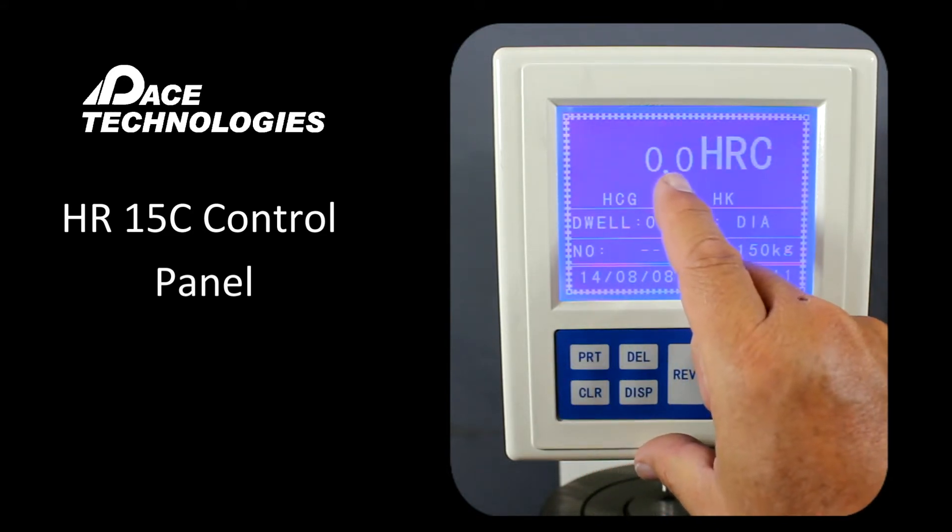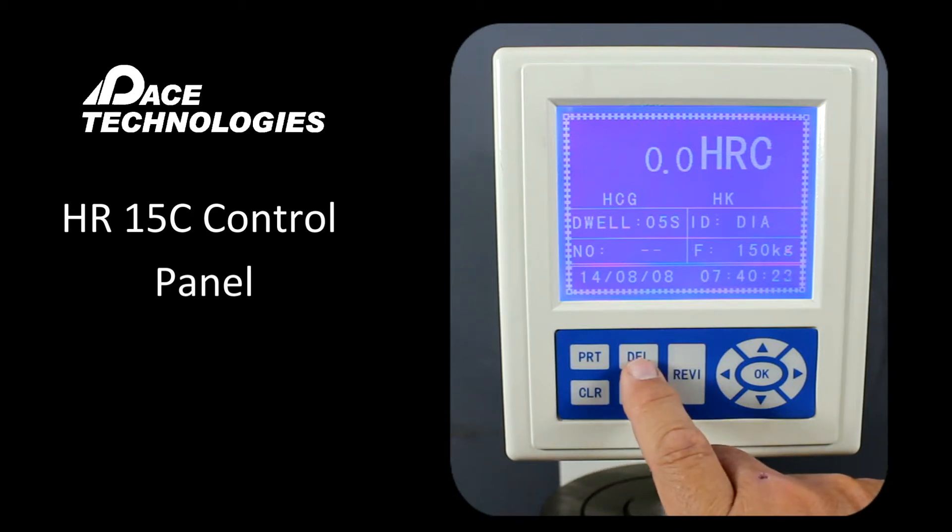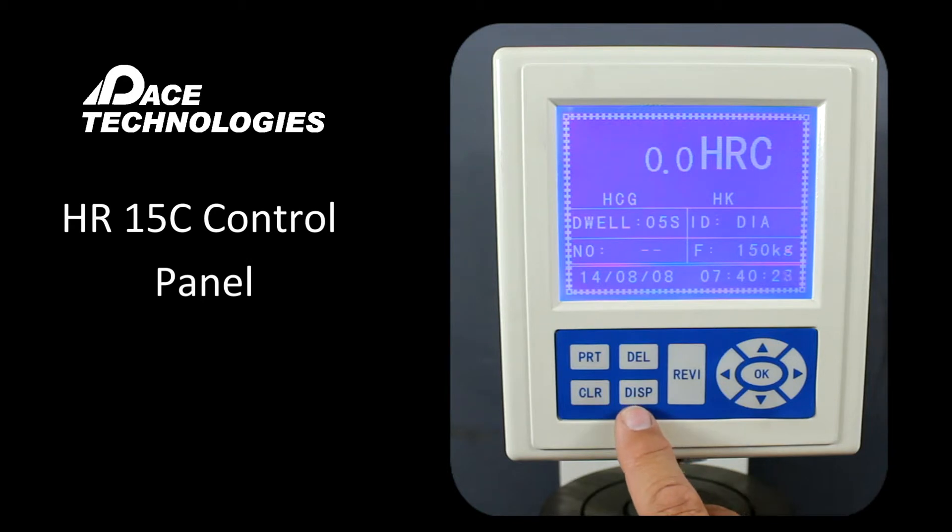If this number here is not showing zero when we first start without any load applied, we'd want to go ahead and clear or reset that to zero with the CLR button. Delete would be used to delete the last measurement if we weren't happy with it. Display will show the displayed value of measurements that have already been made. It should be noted that the first measurement you take will not be included, as this is to essentially set the system — so it's good practice that the first indent is never used.